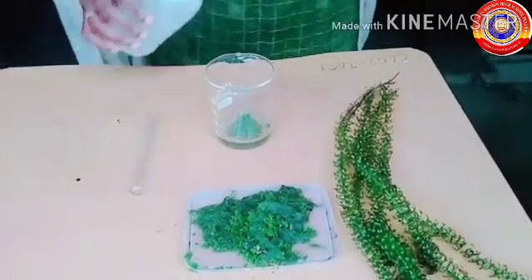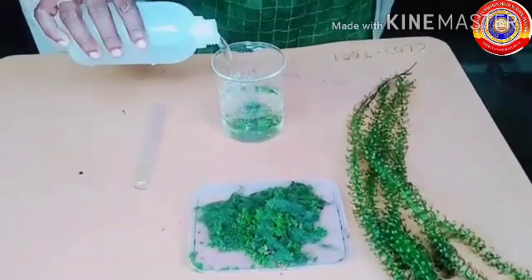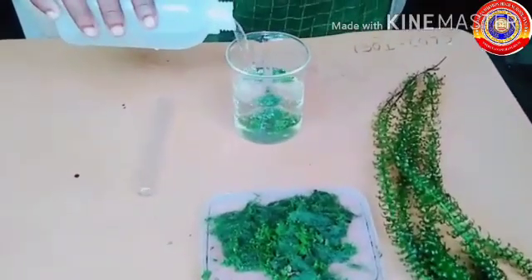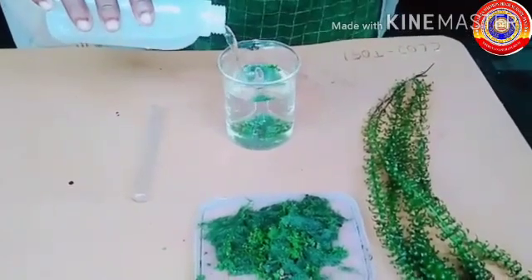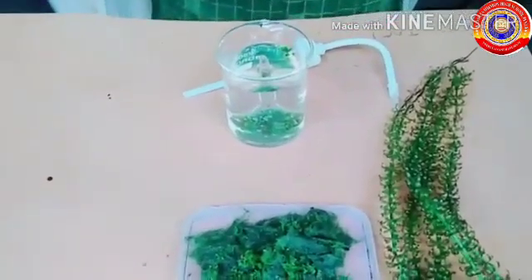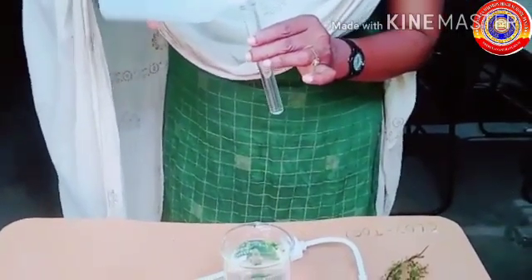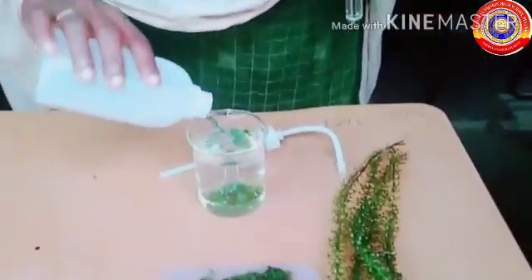Fill the beaker with water. Place a test tube filled with water onto the funnel.